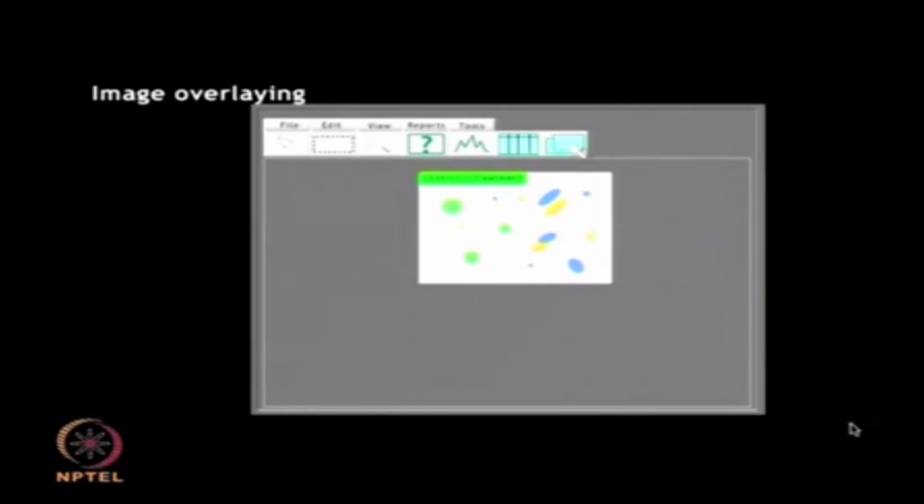This is extremely helpful while comparing the large clinical samples of controls and treatments, so that you can obtain a clear indication of the proteins which are differentially expressed.